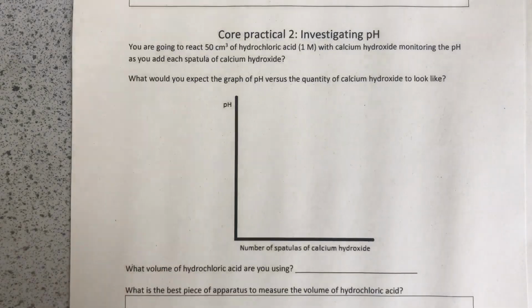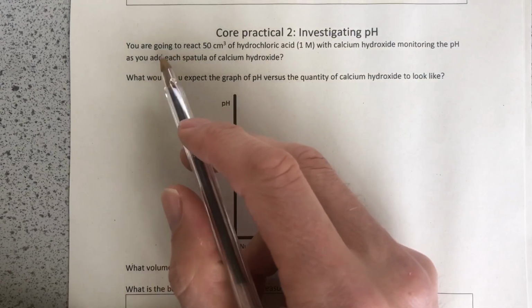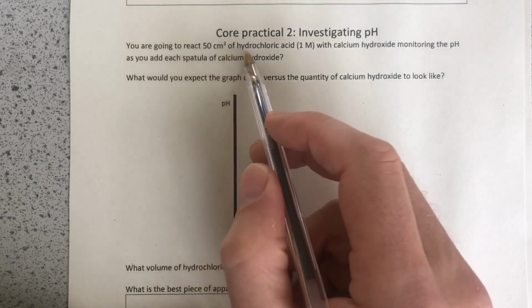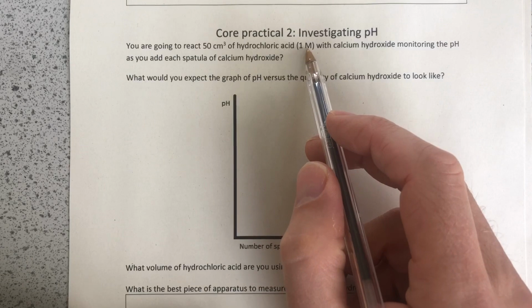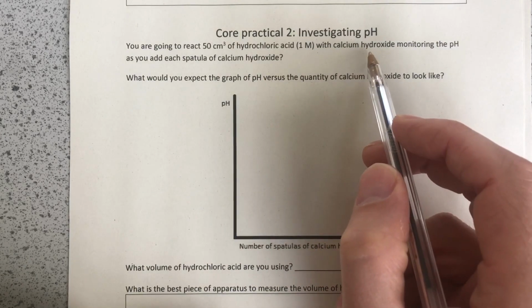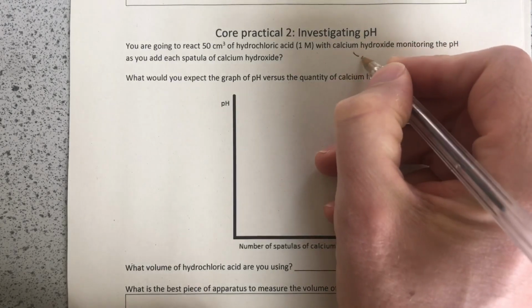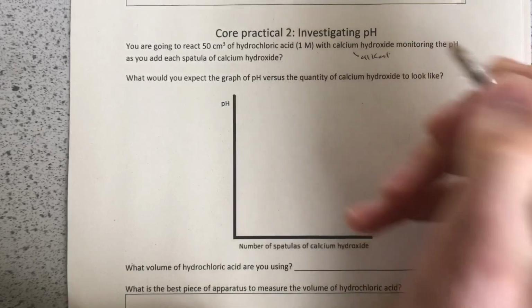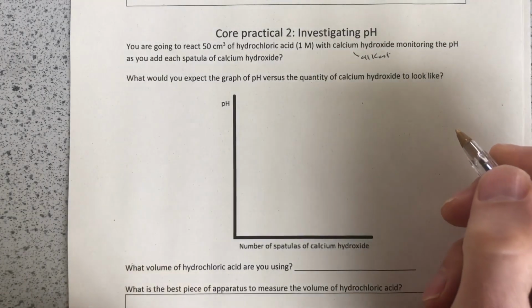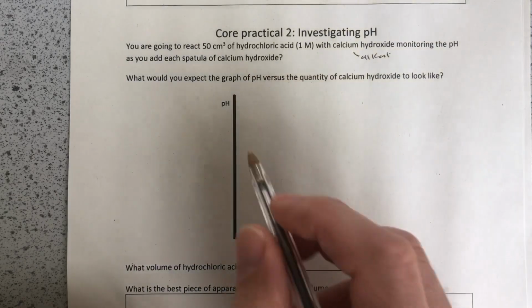Our second core practical is investigating pH and neutralization. So what we're going to do is take 50 centimetre cubed of hydrochloric acid, 1 mole per decimetre cubed, and we're going to neutralise that with calcium hydroxide. And as we do so, we're going to monitor the pH. Now, calcium hydroxide is an alkali, okay, and it has a pH of about 12. And we're going to monitor the pH for every spatula we add.